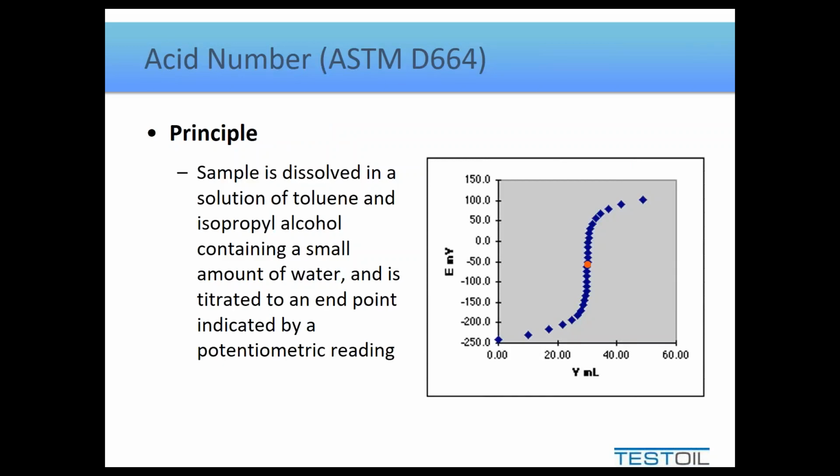We're measuring the potential on the oil sample. So by measuring the potential, we see when there is a change in the potential, and we can identify that inflection point, and what we'll get is a slightly different answer. So to that end, ASTM is pretty clear about comparing results between these 2 tests, and that should not be done, that they will in fact yield significantly different results.